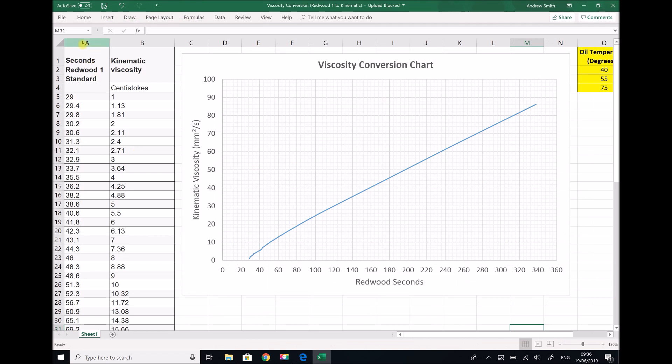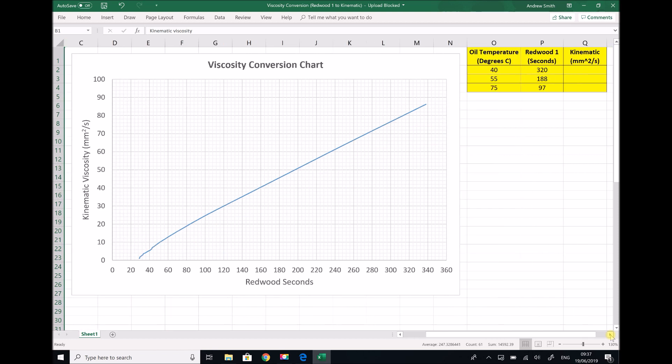What I've done is copy this table into Excel in order to produce a conversion graph. On the left hand side we have the two useful columns: Redwood seconds and kinematic viscosity in centistokes. I've plotted these on an XY scatter graph up to 360 Redwood seconds — chosen because our highest reading was 5 minutes 20 seconds, which is 320 seconds — and I've set the axis to maximise the space for our conversion graph. To the right of the graph I've extracted the information from our experiment: tests at 40°C, 55°C, and an average of 75°C.